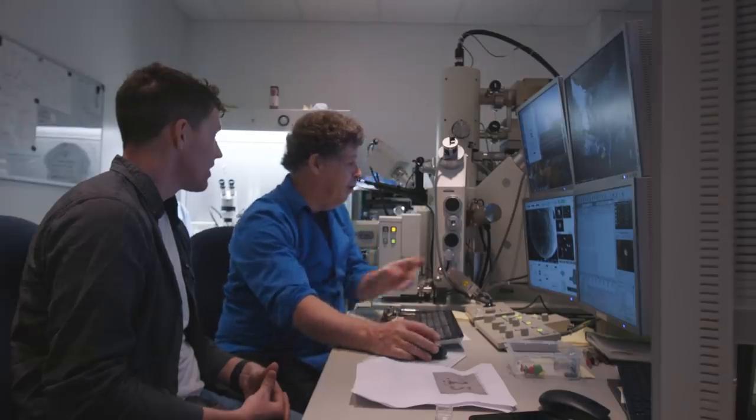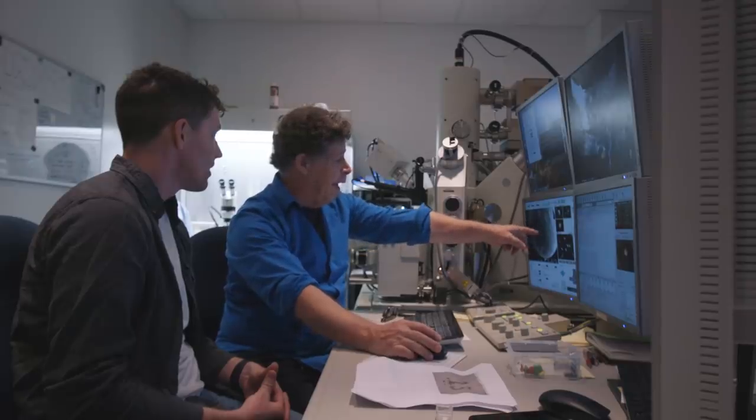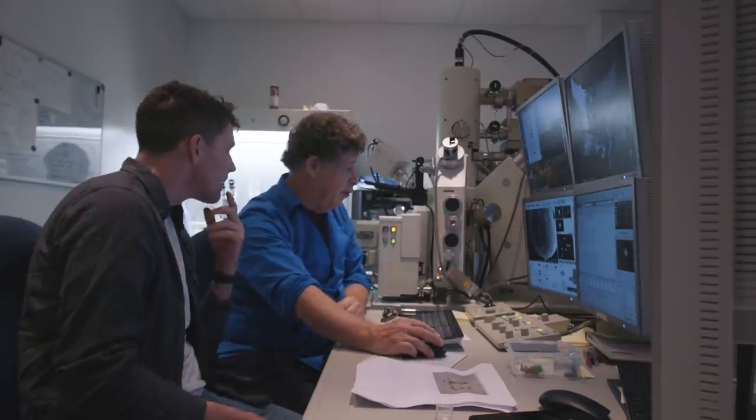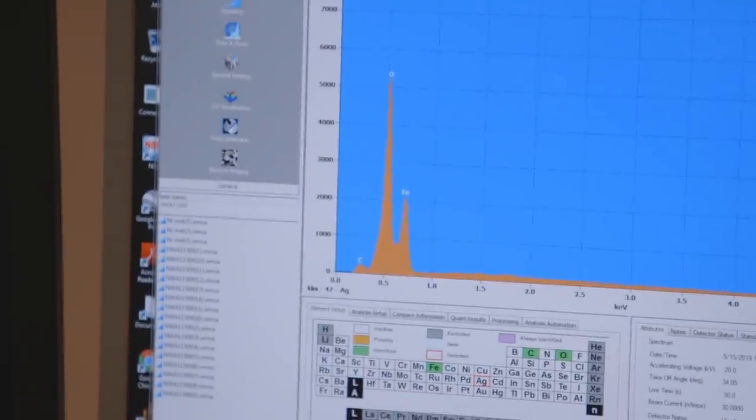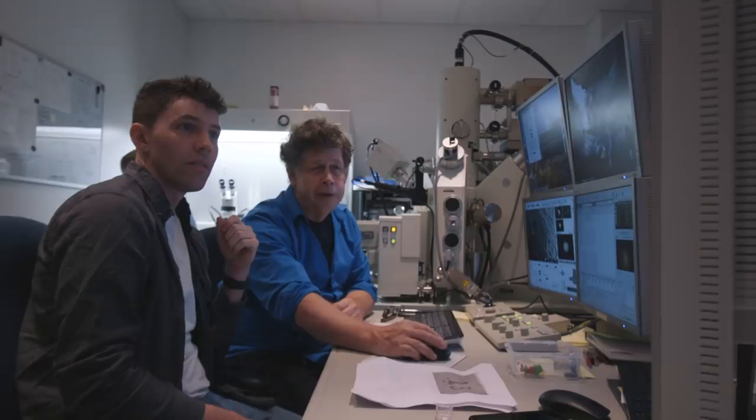So here's a second particle. Again, we see this same pattern. These little flattened crystals on the outside, which again are magnetite. Over here, iron oxide, right? It's probably terrestrial contamination.